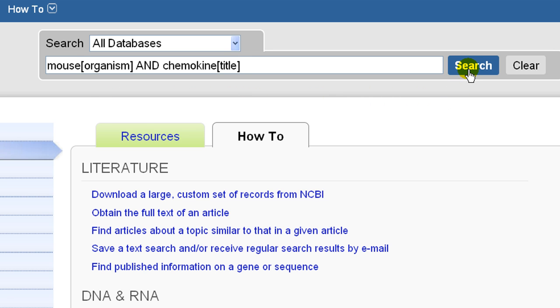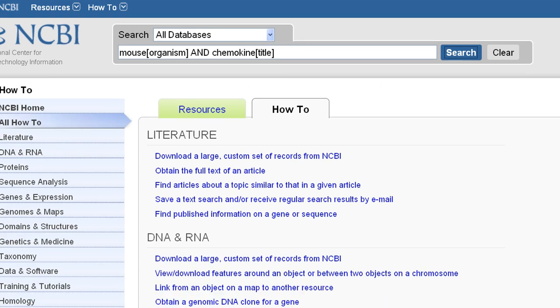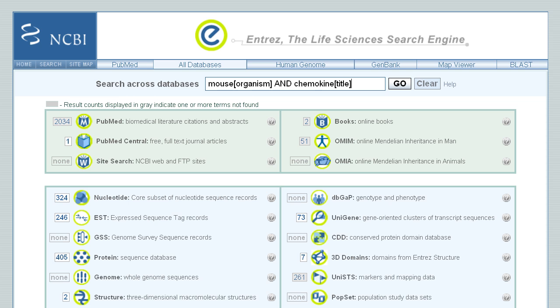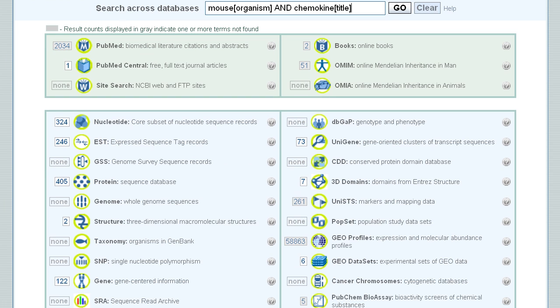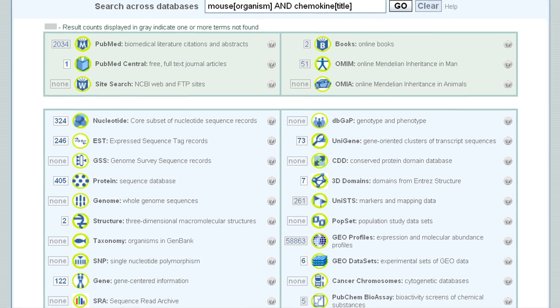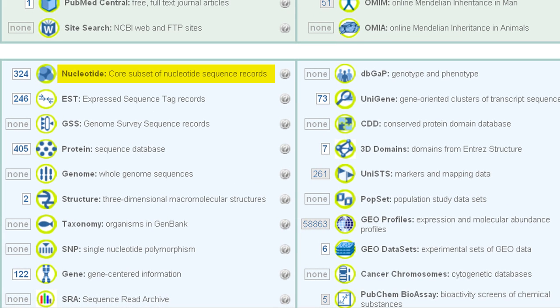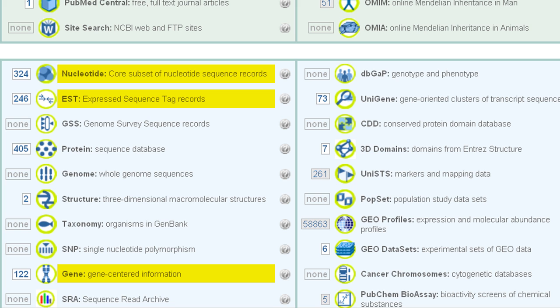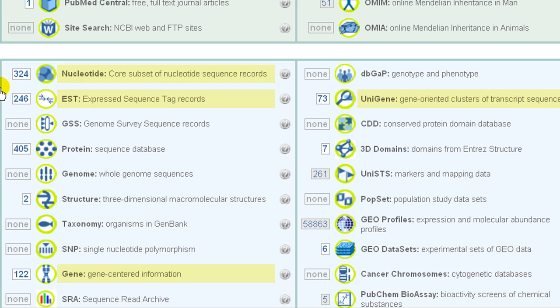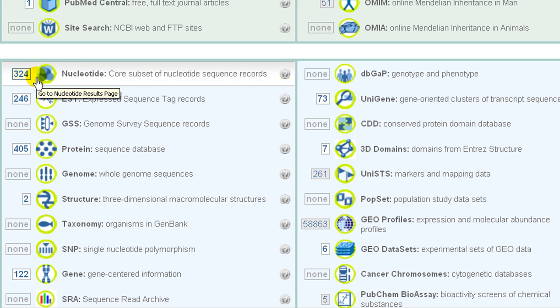Click Search. Since we're looking for mRNAs, we could pick databases such as nucleotide, EST — the database of expressed sequence tags — gene, or unigene. Let's view the records in nucleotide.